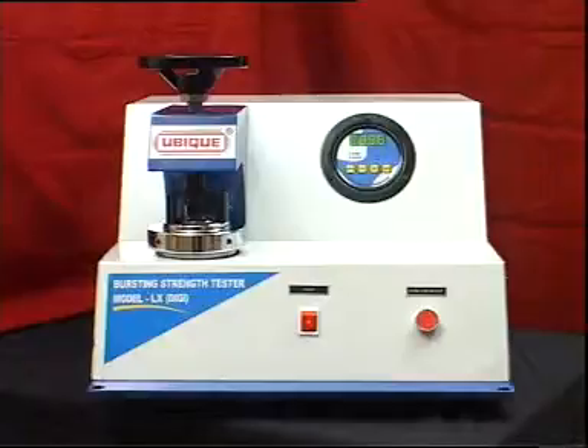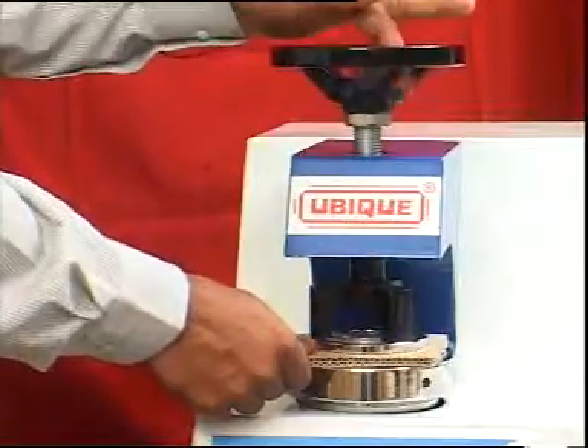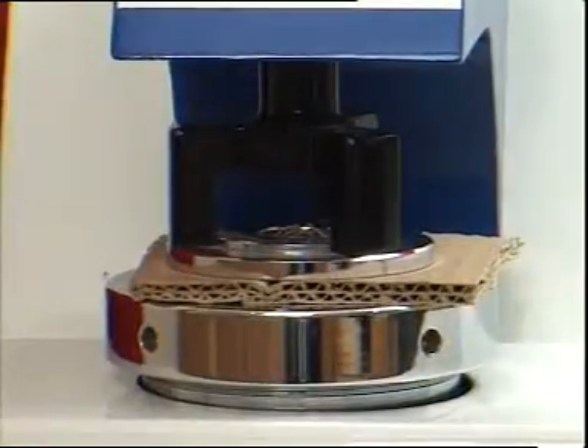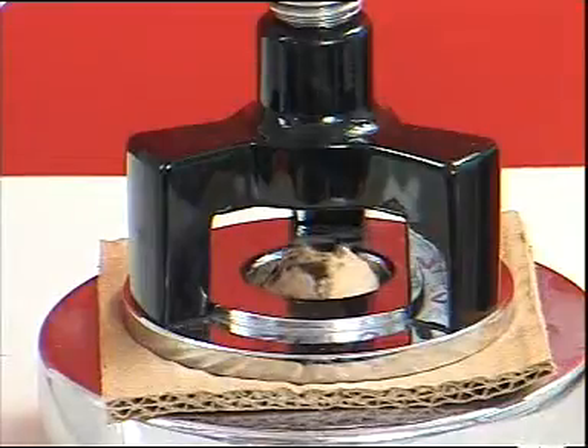Bursting strength tester. Among the strength properties of paper and corrugated board, the most important and widely accepted parameter is bursting strength. The burst factor, BF, which relates bursting strength and grammage, is the most common indicator of the strength of paper and corrugated board.